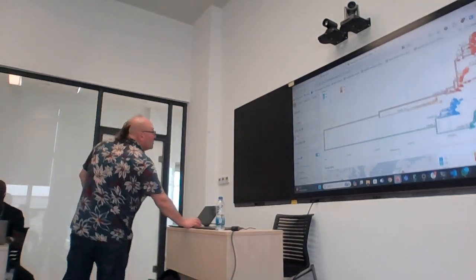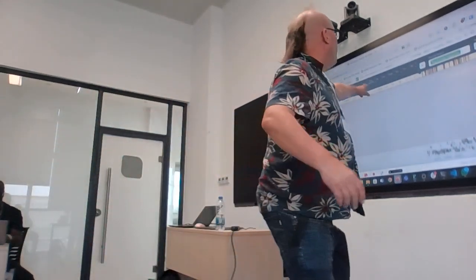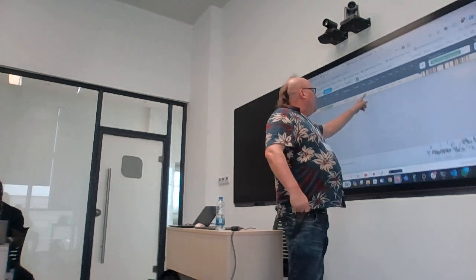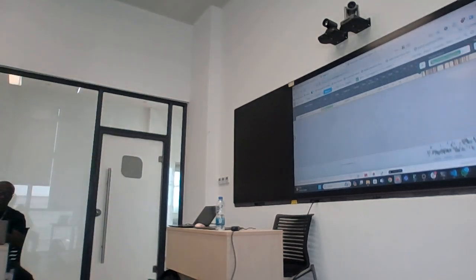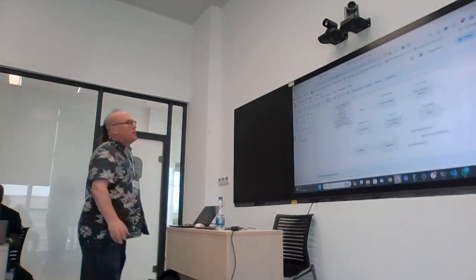And if we see here, still 93% coverage, okay? Still that is looking the same. B1 lineage, 58 mutations. We see there's more mutations listed here, okay? Because I'm comparing against the older sequence, okay? This is more like what you will see when you've got a clade 1, because you're comparing against the older reference, right? So, what I wanted to discuss quickly this morning before handing over to Stanislas is how did we get to here, okay?